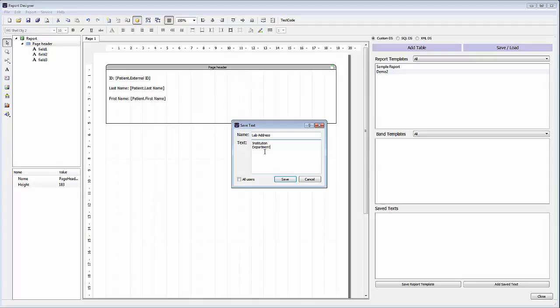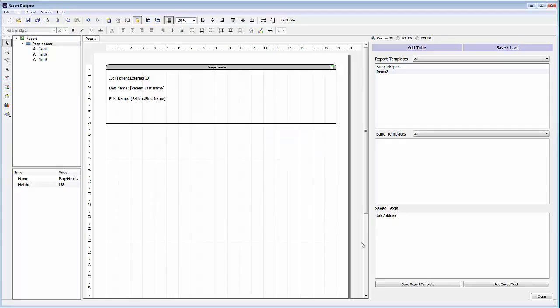We may want to include information such as the institution, the department, a street address, city, state, and zip code, a phone number, and maybe we'll also add the laboratory director name to be included here as well. Once this information has been entered, we'll just click save. We've now saved this text so that it can be included in any report template.